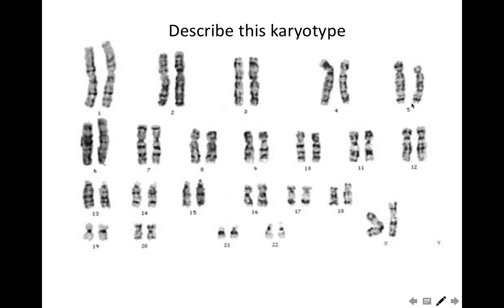لو بصينا هنا على الكروموسوم 5 هنلاقي ان في حتة منه طايرة lost اللي فيها الدارك باند اهي terminal part of the P arm of chromosome 5 is not present, absent, is broken, is lost. يبقى there is a deletion in the P arm of chromosome 5. Okay, let's continue and screen the rest of the chromosomes. Maybe we find another abnormality.